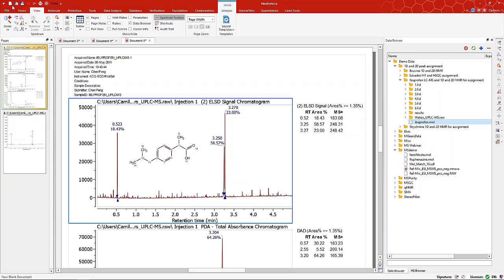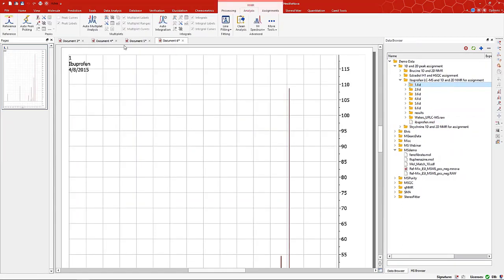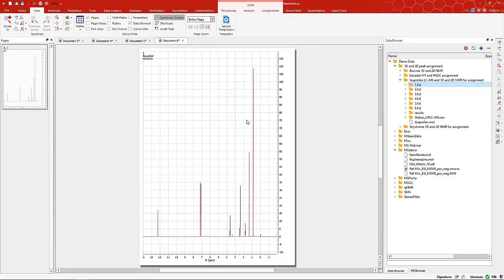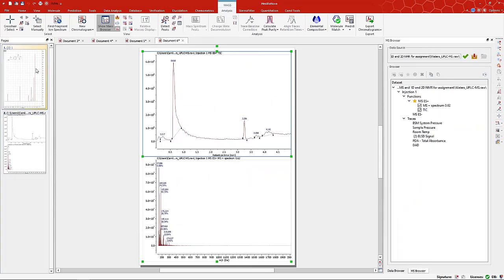So let me show you one more. I'm going to create a new page. And again, you don't have the script, so don't worry about running. I'm going to incorporate a proton spectrum. Let me go back to view. Yep. And then I'm going to bring in the structure. And again, the open access data. This script will take a little longer to run because now it's going to do a bunch of things, and I'll describe. I don't need that because it will generate that.